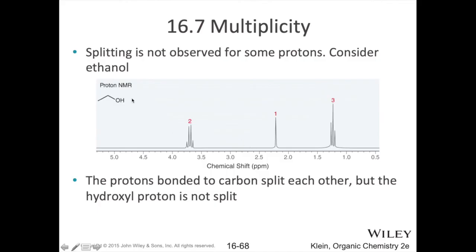Even though the CH2 of our ethyl group is split into a quartet by the CH3 over here, it's not being split any further by the hydrogen in your alcohol. Likewise, your alcohol, as I mentioned, is a singlet. It's not being split by the CH2 group either.